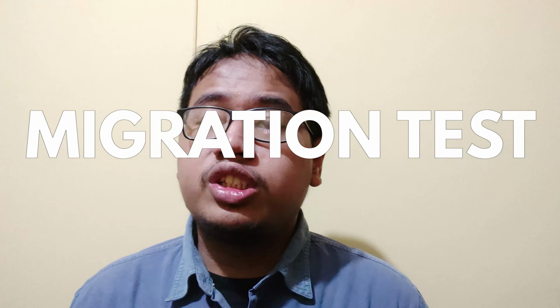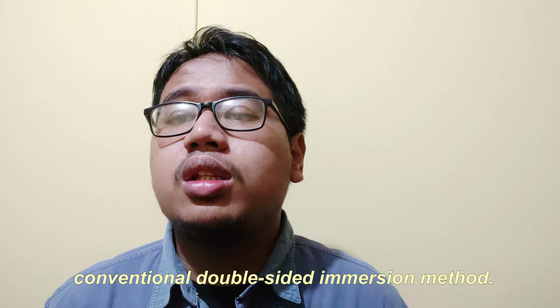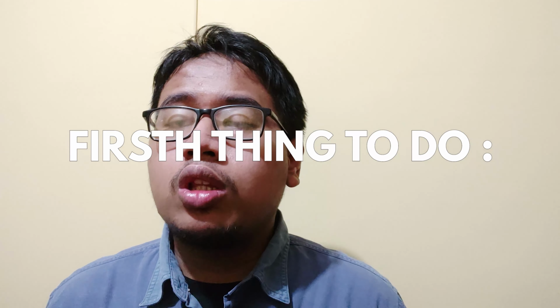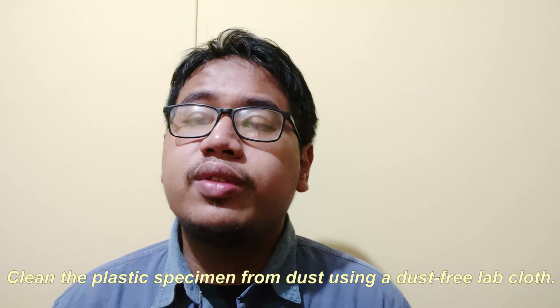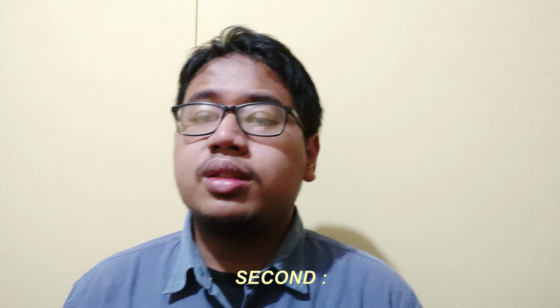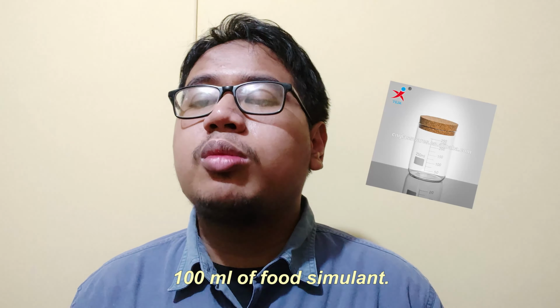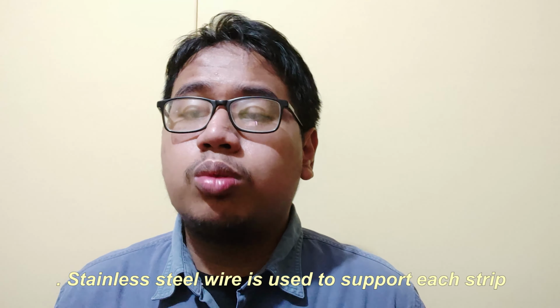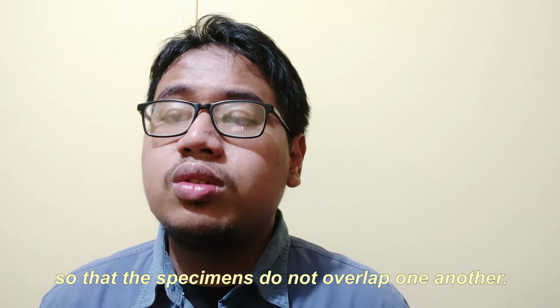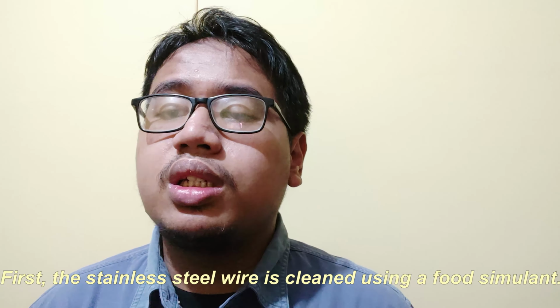We continue to the migration test. The total migration test was carried out by the conventional double-sided immersion method. What we have to do is, first, clean the plastic specimen from dust using a dust-free lab cloth, and second, insert the specimen into a beaker or glass jar containing 100 ml of food simulant. Then the stainless steel wire is used to support each strip so that the specimens do not overlap one another. First, the stainless steel wire is cleaned using a food simulant.